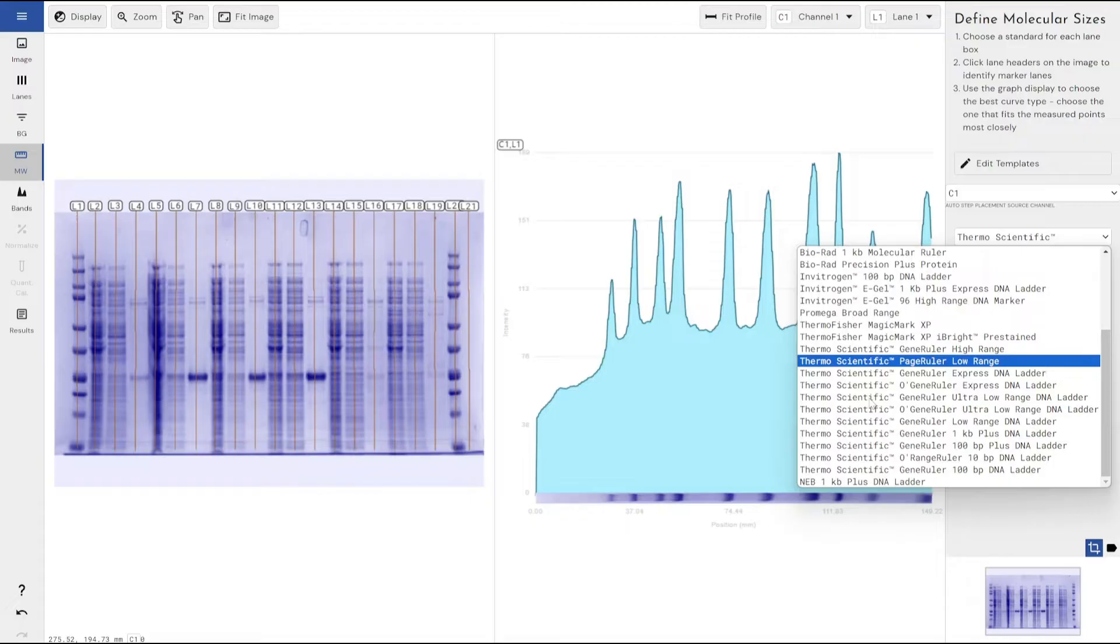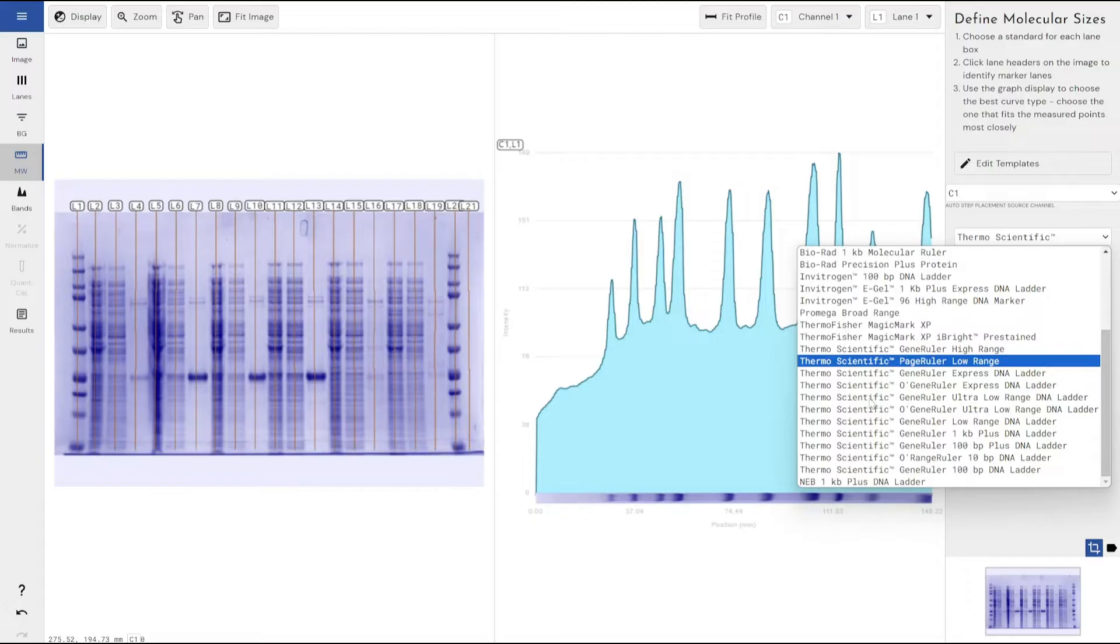We have built these using the information that is freely available on the manufacturer's website, but I do want to highlight that these can change at any time. So please check that if you're using one of these pre-built templates, that they are still relevant to the batch that you've got.